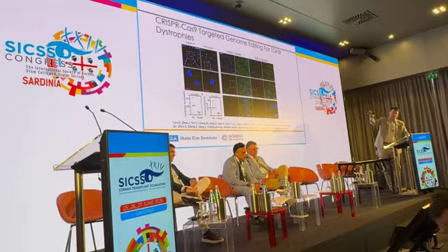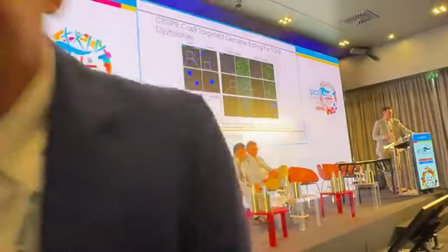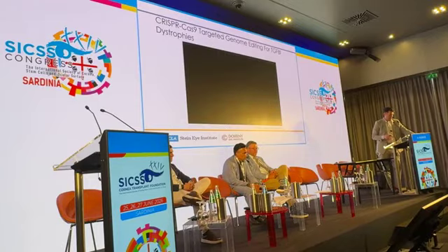On the left are the cells not exposed to the PDVs. On the right are the cells exposed to PDVs, and we can see a knockdown or silencing of the RNA of the TGF-beta-I. Now, the other images we see, again, untreated and treated. In this case, we're looking at TGF-beta-I protein expression, and again, we're seeing a significant reduction in the expression of the TGF-beta-I protein in these keratocytes from a patient with a TGF-beta-I dystrophy.